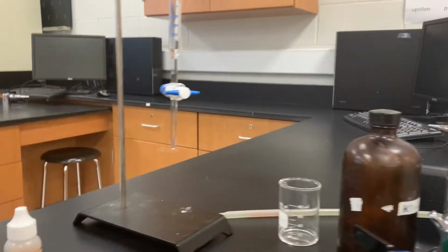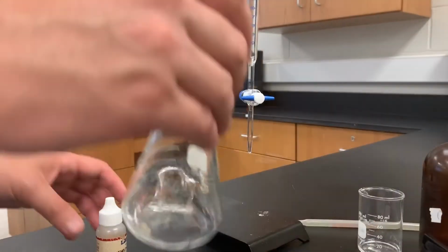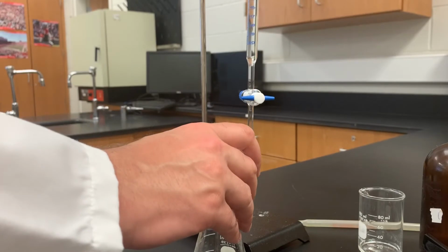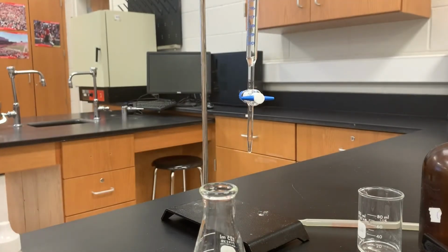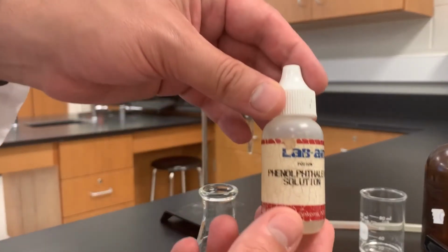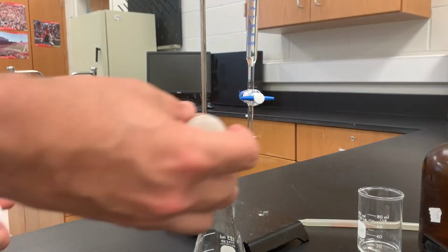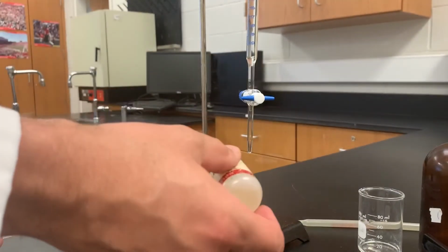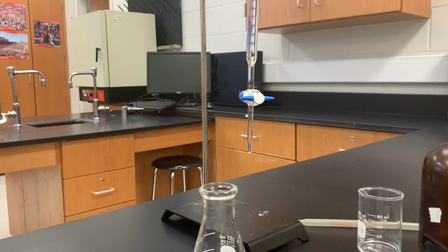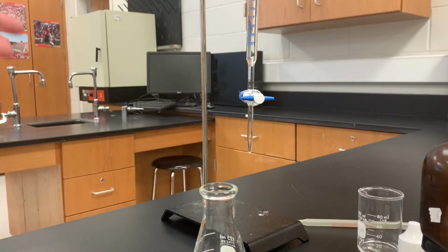So now I'm going to use the burette to add the base to the acid. When they react, we're going to make water and sodium chloride. That's going to be the products of this reaction. But in order to know when the reaction is complete, I need something called an indicator. For that, I'm going to use this stuff called phenolphthalein, which in an acidic or neutral solution is clear or colorless. And when the solution turns basic, it turns a pink color. And so it'll let us know when we've added just the right amount of sodium hydroxide.